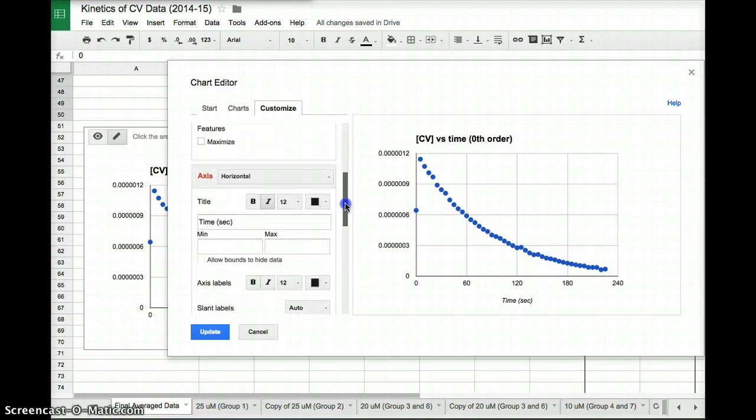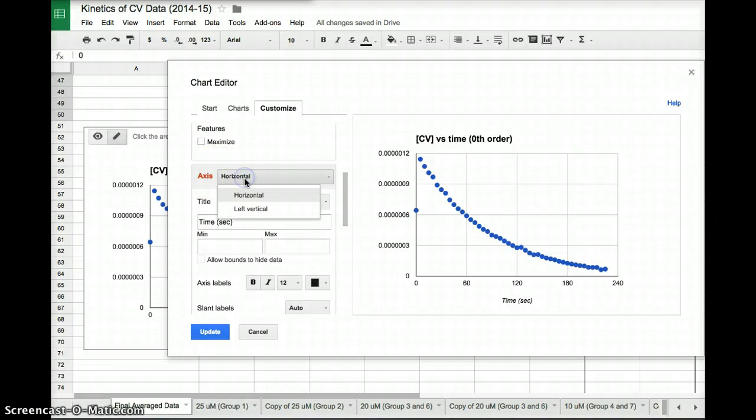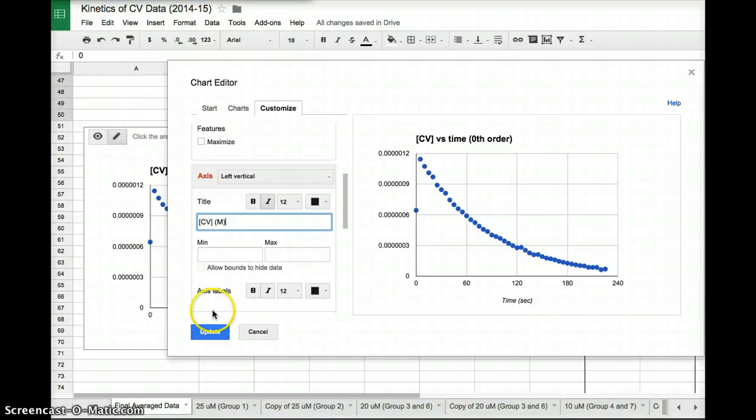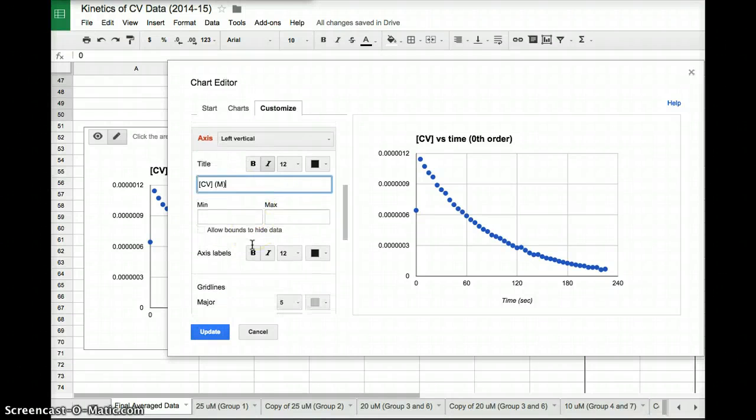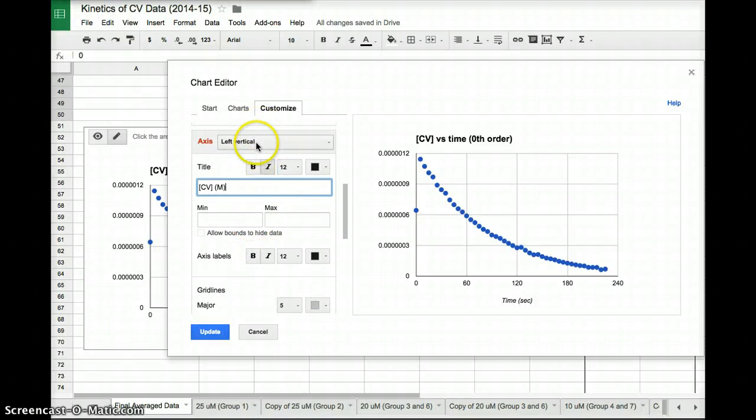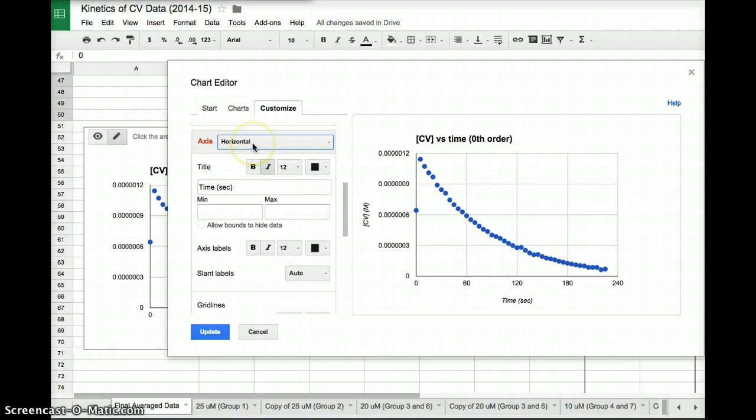More importantly to me, though, I want to label the axis of the up and down, the vertical. So here where it says axis, I'm going to select left vertical. And I'm going to type in concentration of crystal violet. I'm going to put the units molarity. If I click on where it says left vertical, I could go back to horizontal and change the time to something else if I wanted. But we want it in time, so I'm going to leave it the same.